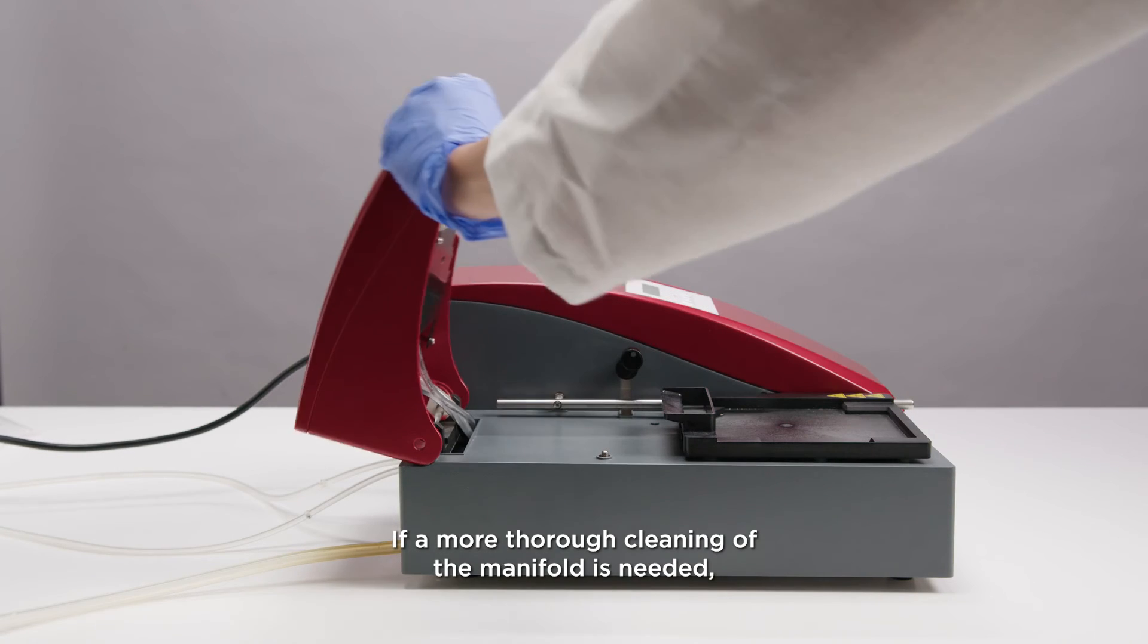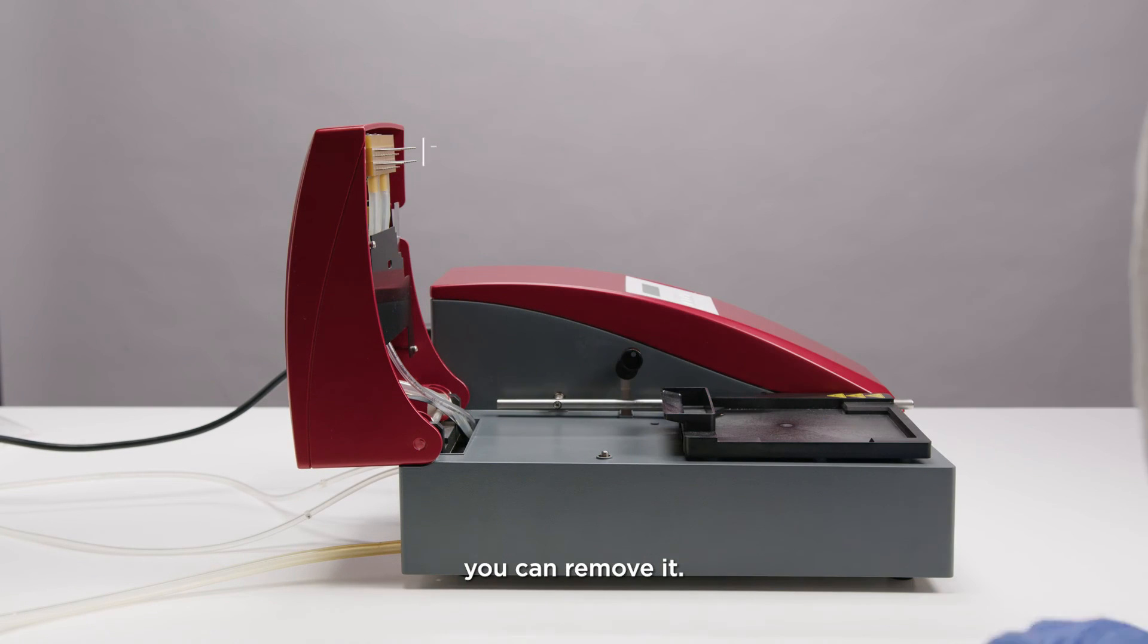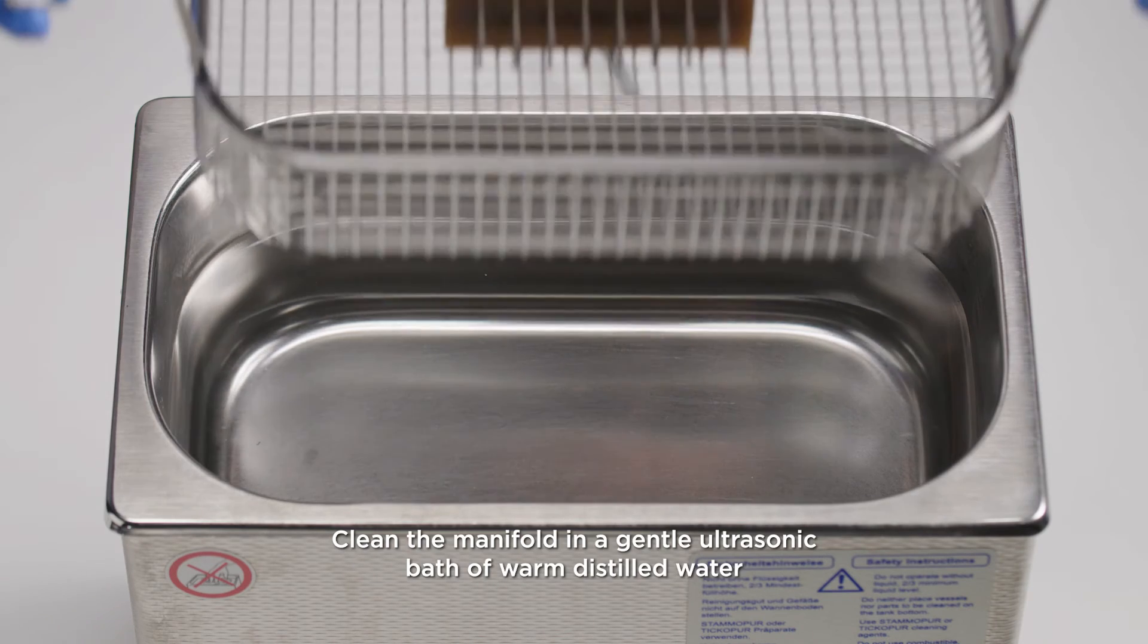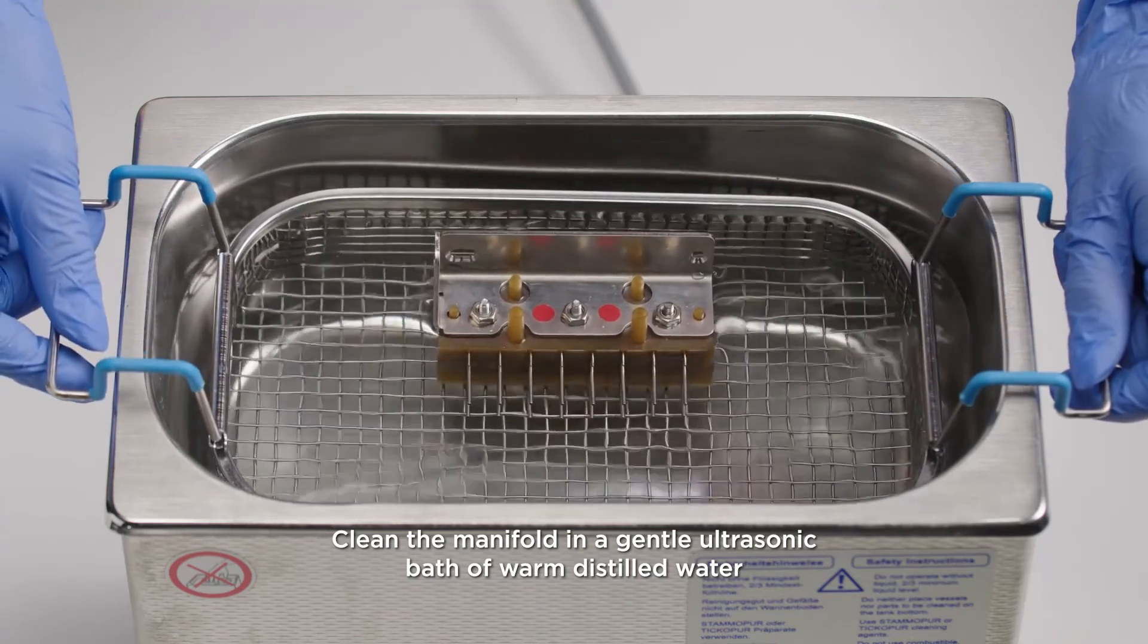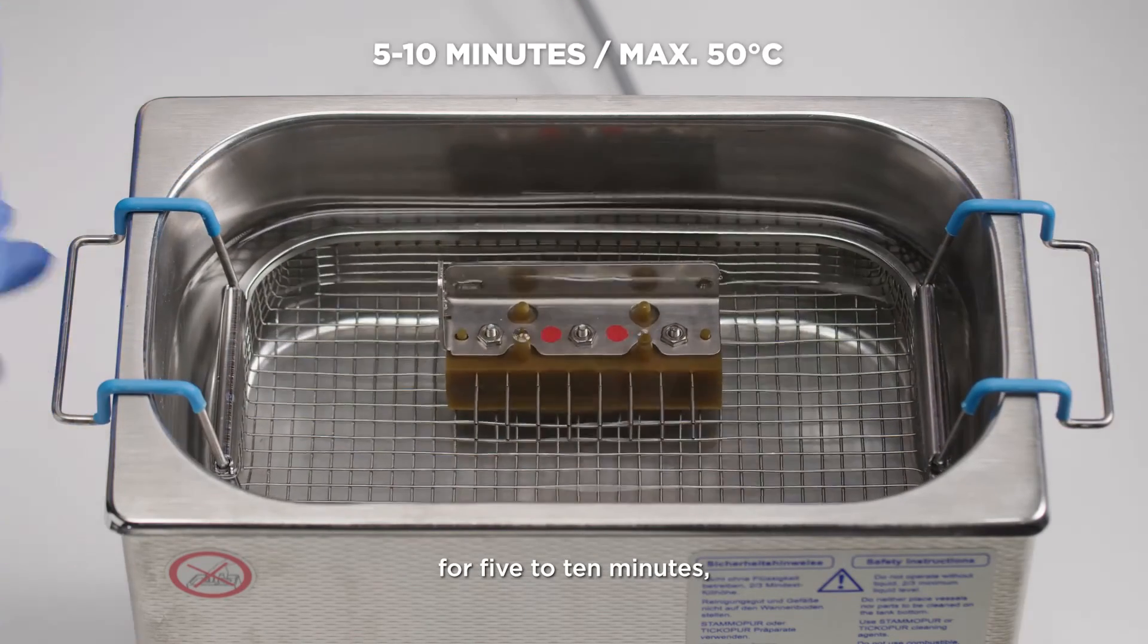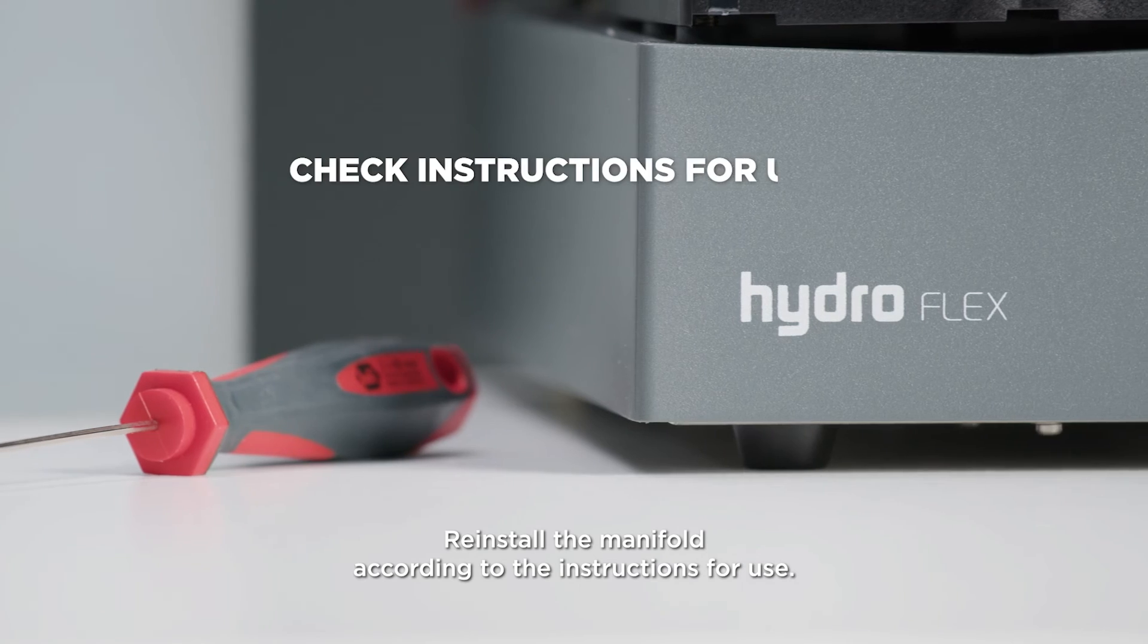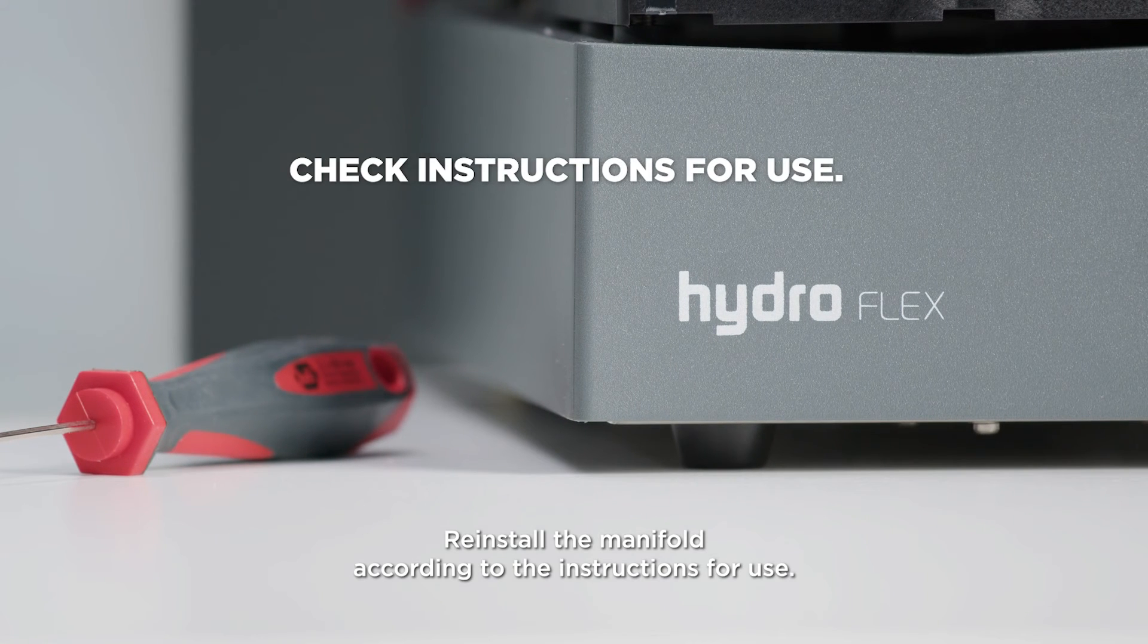If a more thorough cleaning of the manifold is needed, you can remove it. Please turn off the instrument and remove the manifold according to the instructions for use. Clean the manifold in a gentle ultrasonic bath of warm distilled water for five to ten minutes to remove salt crystals blocking the needles. Reinstall the manifold according to the instructions for use.